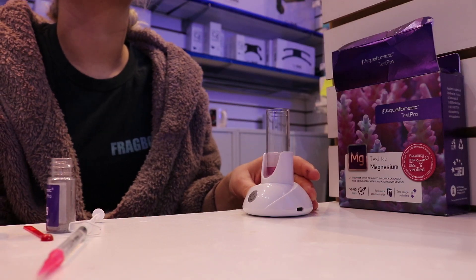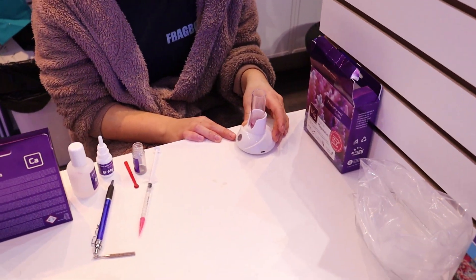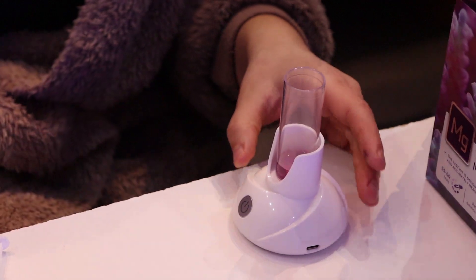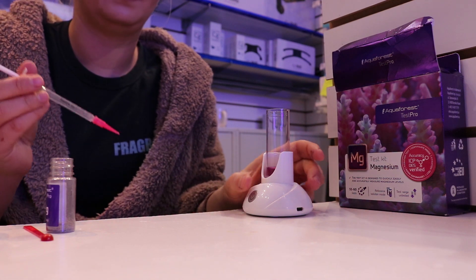Why did this customer bring us his water? We've been monitoring his water for a little bit, making sure everything is staying consistently at the right parameters. If you need help testing your water, bring it by your store — happy to test it for you, small charge for that, but it's good to know where stuff is in the tank.